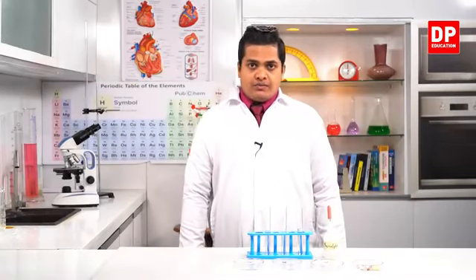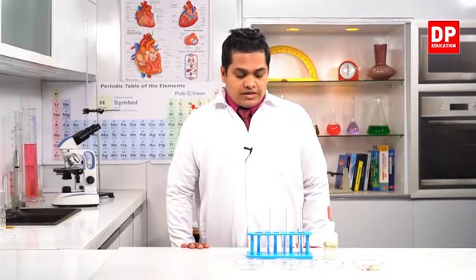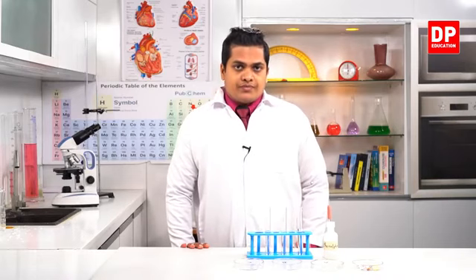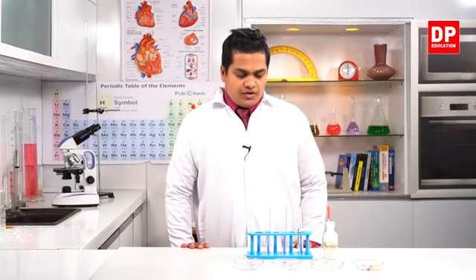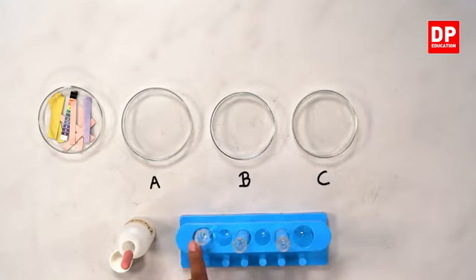Now in this activity we'll be observing some acids, some bases, and some neutral substances. As examples, we took solution A, HCl solution, hydrochloric acid. The second one, B, sodium hydroxide solution.